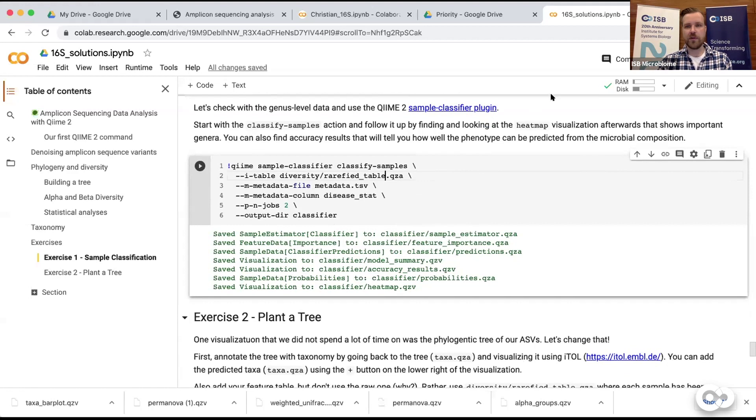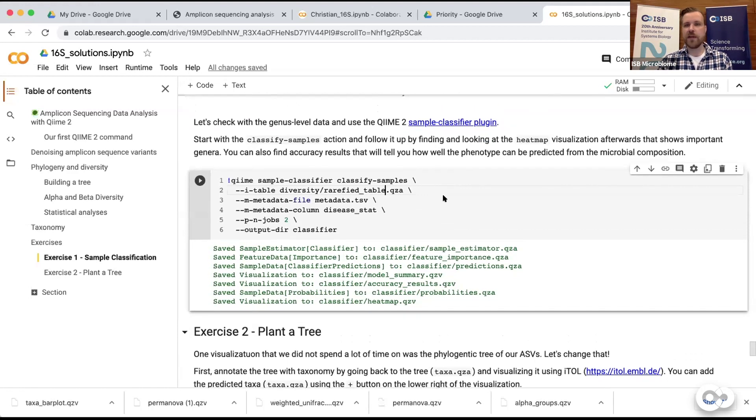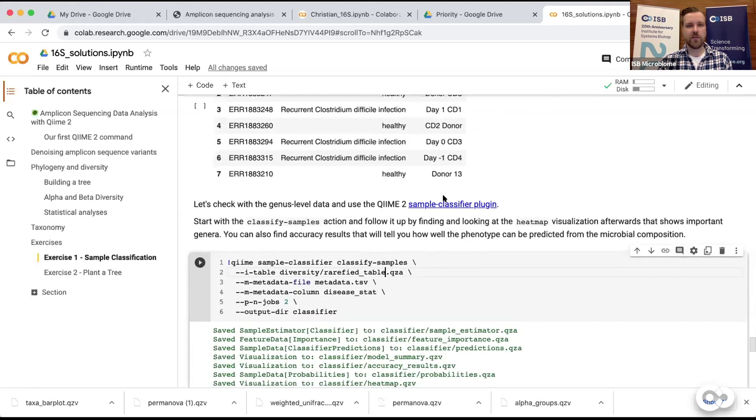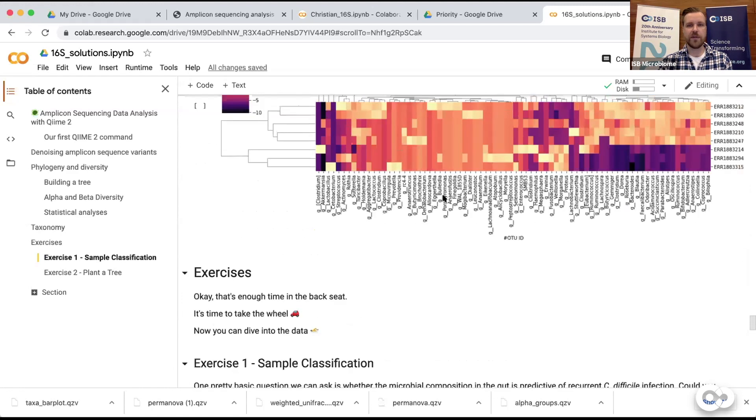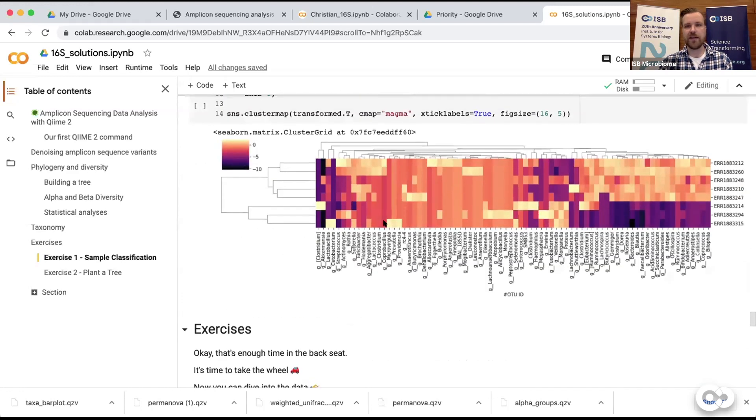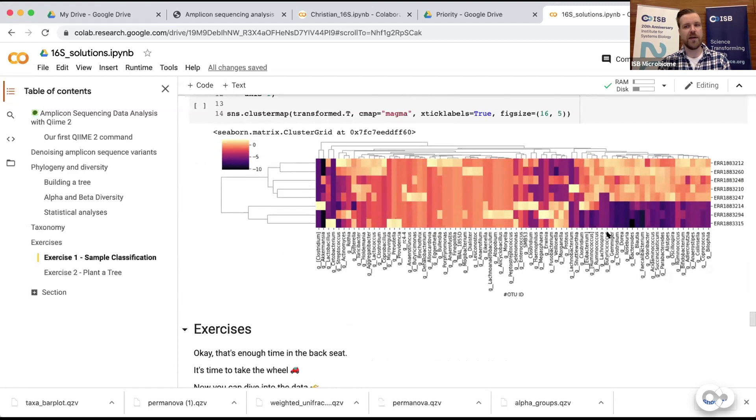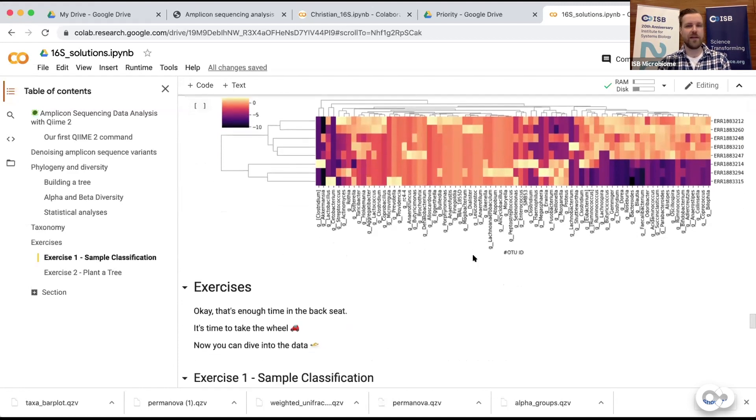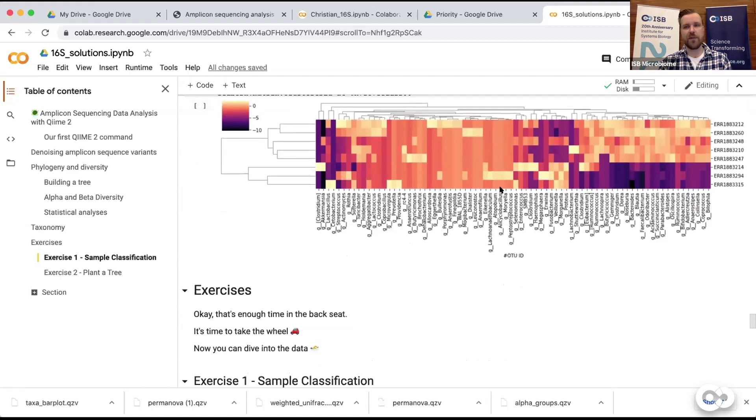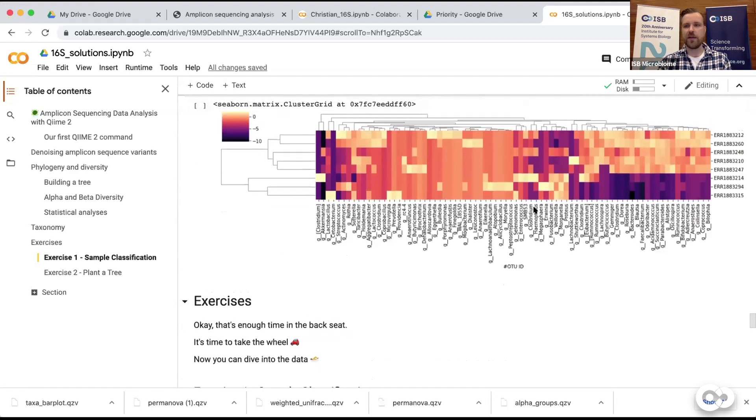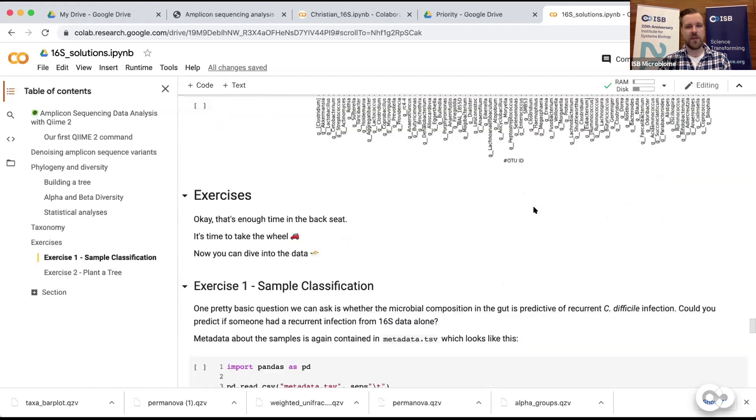Then we have our output directory, which is basically the classifier directory where we would have saved the data. I think most of you actually managed to run something very similar and it would have given you quite some files to look at. I told you to look at the heatmap visualization, which looked similar to what we generated beforehand. Now it would have done that for each individual amplicon sequence variant, or if you used the genus level data it might have looked very similar but probably used two rows.